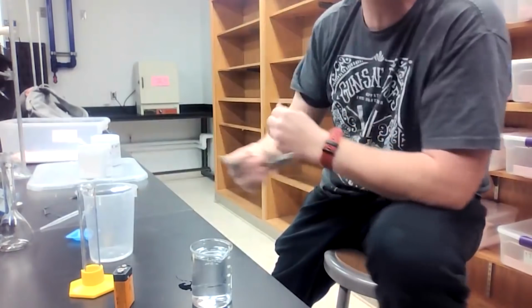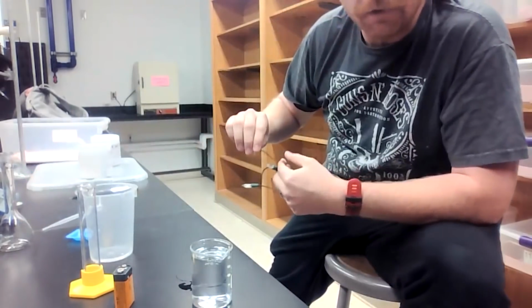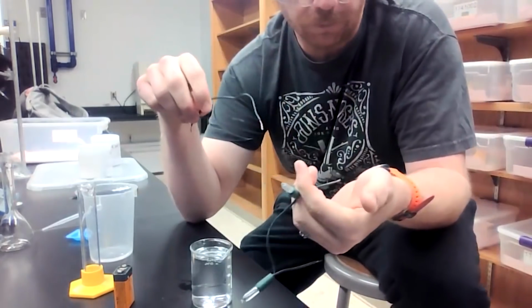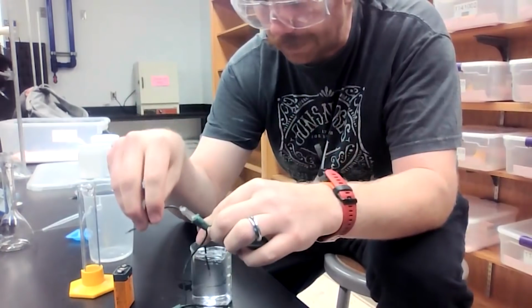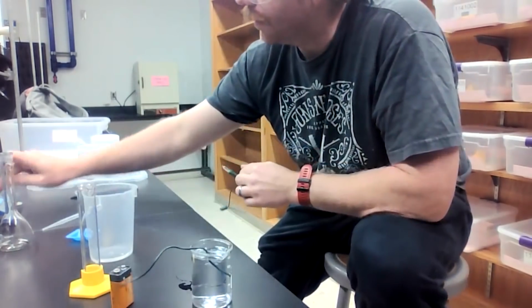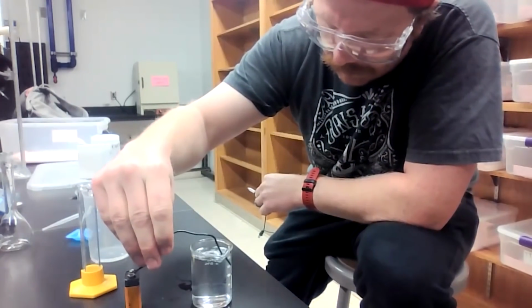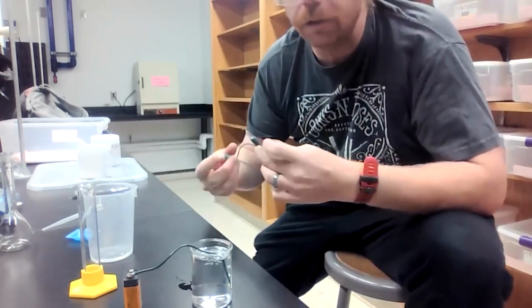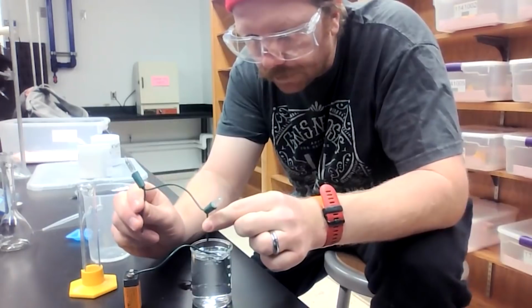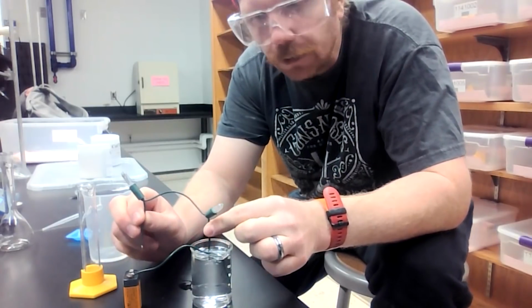solution 1/4 as concentrated. I want to test if I see, well, basically the same. Do I get any sort of conductivity? Do I get my light system to light back up? Oh, I gotta get my battery light system in good shape. Okay, there we go. So this has ions, like dissolved ions, but considerably fewer. Okay, well, it still lights up, so that's good.